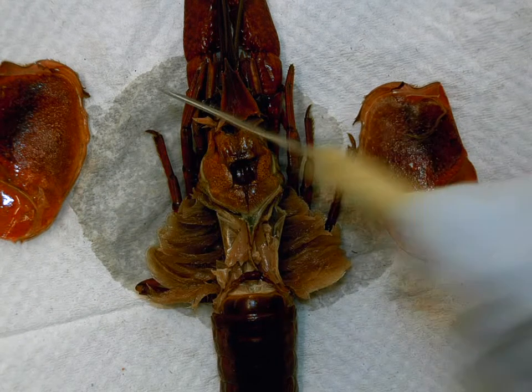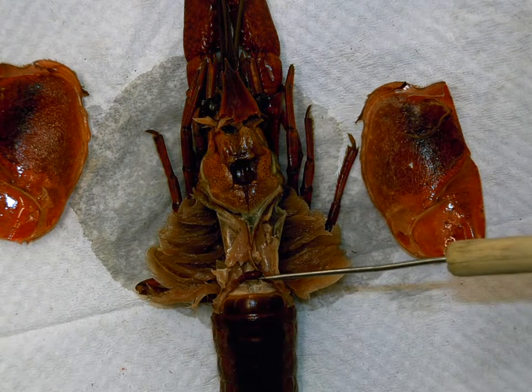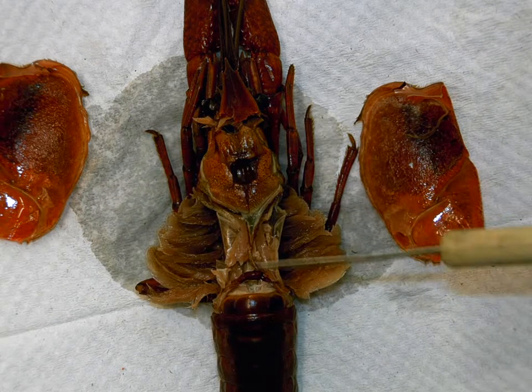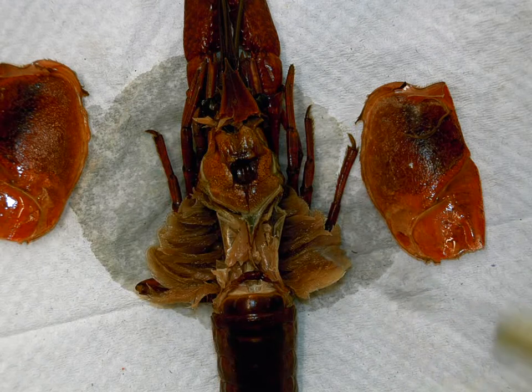We've removed the exoskeleton on both sides, and what you should see is kind of this reddish-colored dark brown line here, as well as coming up here and over to the sides, which is pretty much blood vessels, which lets us know we're in the right region.